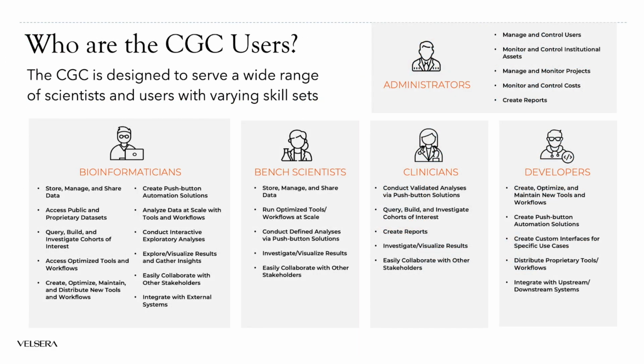The CGC serves a wide range of scientists and users with varying skill sets. There are bioinformaticians with some programming experience and developers that are able to create their own tools and workflows. For bench scientists and clinicians that are not as familiar with command line programming, we make it easy to find the tools you need for your analysis without getting bogged down with all the coding. No matter what skill level, there are tools and resources to help.